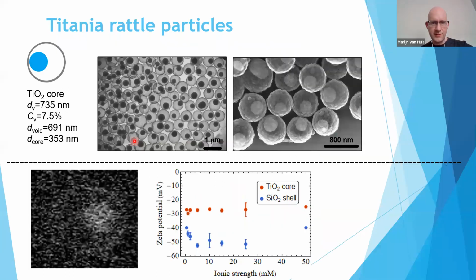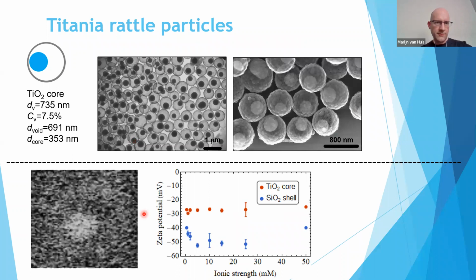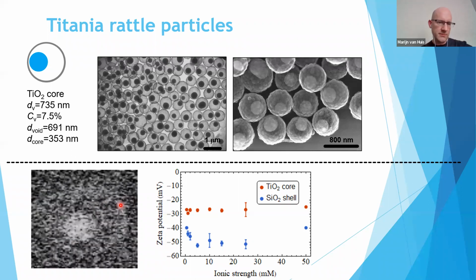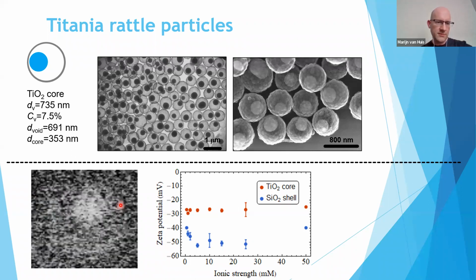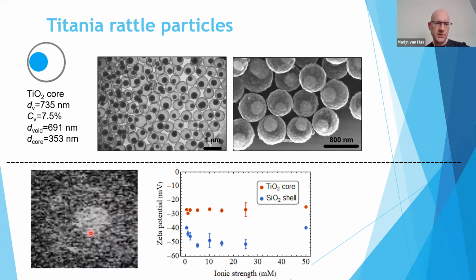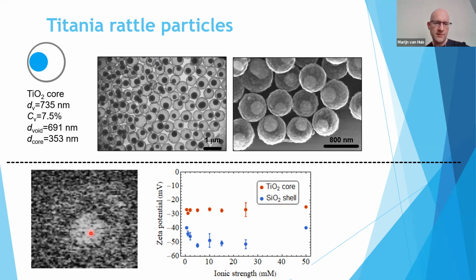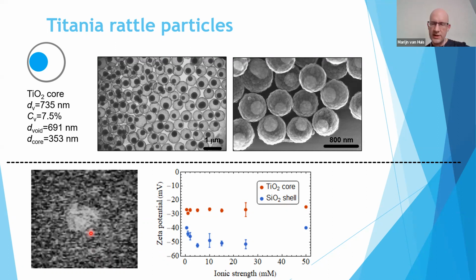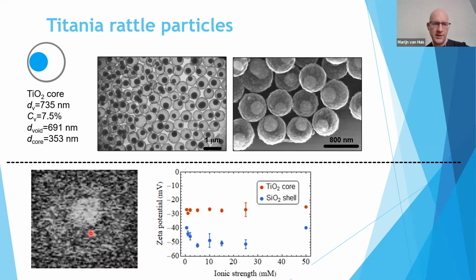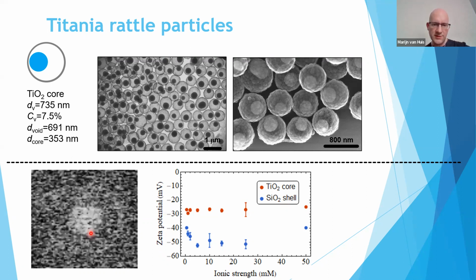And then this is the result. Now, from a very large number of images, we can track what is the area that is seen by the core. So this is a raw image just to see what the data looks like. We go, of course, to the very, very minimum that we can achieve in electron beam exposure in order to get the best result, but that we still have enough signal to noise ratio to do some statistics.